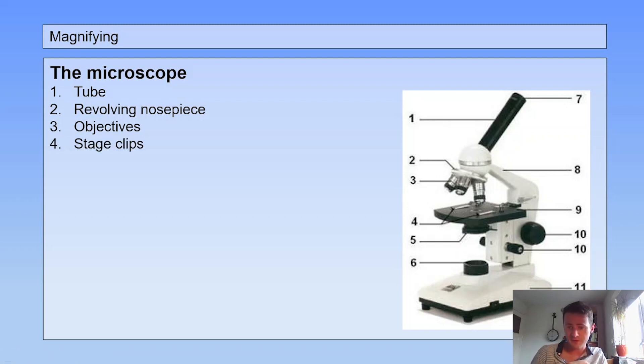Number four, you see them over here, they're the stage clips. Five is the diaphragm or the condenser, and you can control the amount of light coming in. Number six, there's a little lamp inside here, so this is your light source.